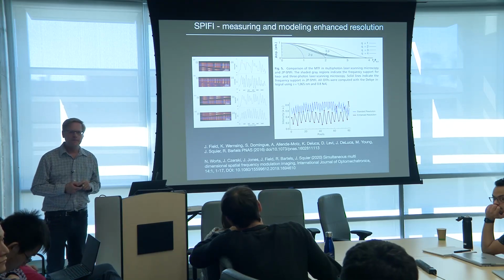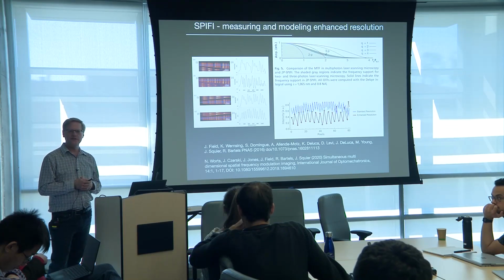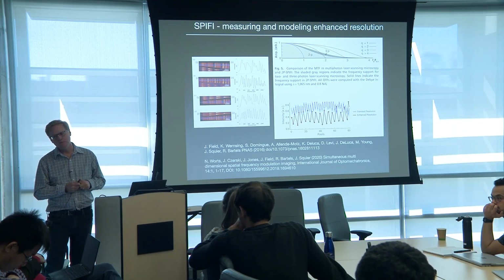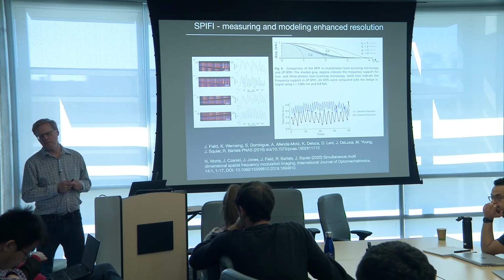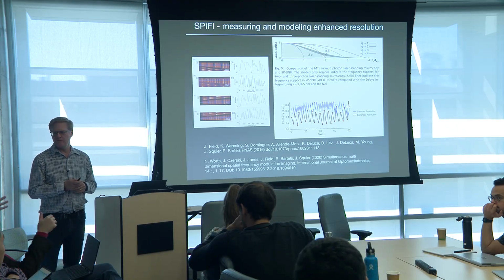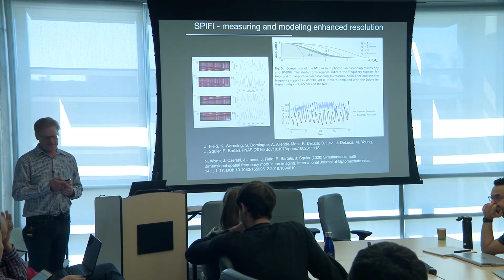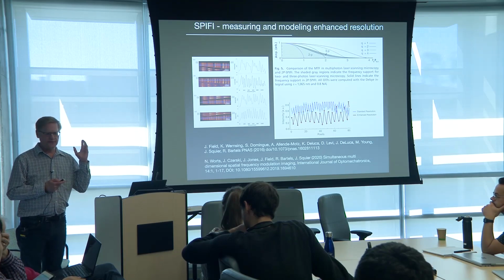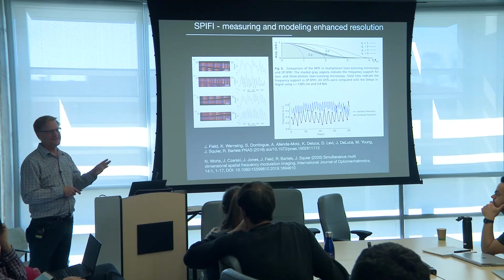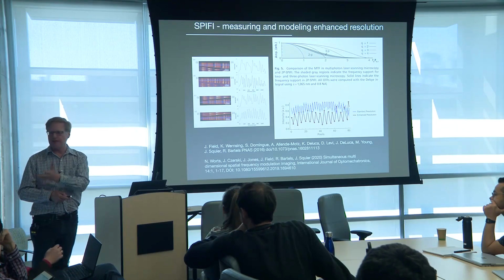This reminds me a little bit of a wavelet decomposition. I don't know if you guys draw any comparison. I haven't personally. But fundamentally, this reminds me a lot of that nonlinear structured illumination microscopy paper that was published, where you would illuminate with a sinusoidal pattern, and then as you ramp up the nonlinearity, you basically start folding in higher orders. Yeah, that's exactly what you're doing in the temporal domain, so you don't have to find those odd materials. And we're doing it with point detection as well, so we can go through scattering. You bring up another good point, because the other thing we see when we apply it to linear fluorescence imaging is that we start to saturate things, and so we're going to be able to exploit exactly that method.